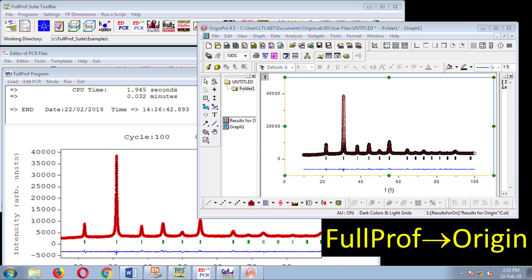Some friends have asked for this video on how to take refinement results from FullProf to Origin. Honestly, when I was learning FullProf, I was struggling to find the option to export data from FullProf to plot in Origin. So I thought this video could be useful for new FullProf learners.